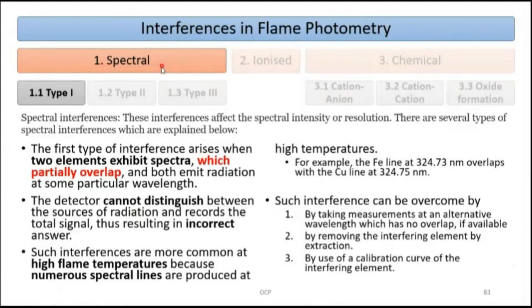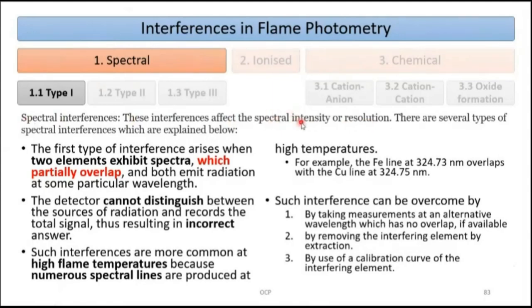Starting with spectral interferences in flame photometry — there are three subtypes. Spectral interferences affect spectral intensity or resolution. Intensity means a specific wavelength expected at higher intensity is present at lower intensity or vice versa. Resolution means when we want to measure 320 nm, nearby wavelengths like 319 or 321 nm interfere.